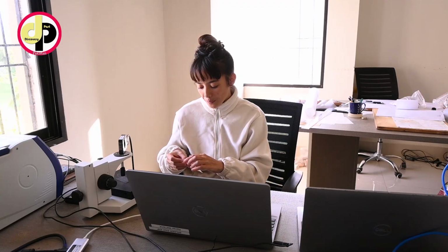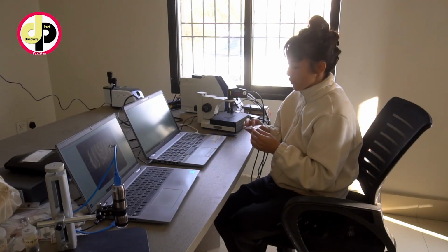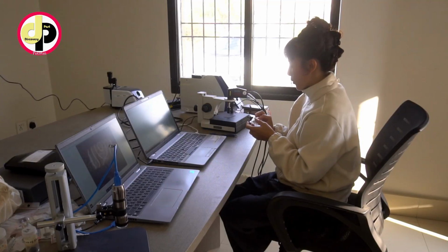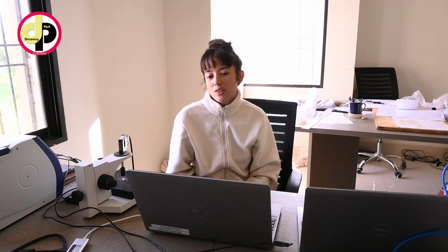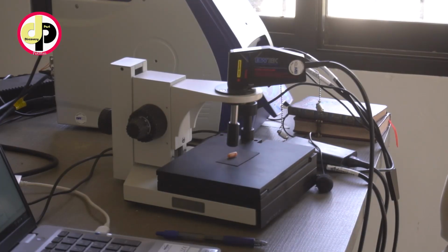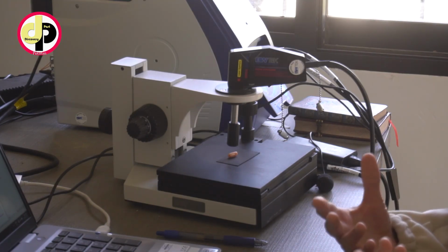So for example, I take one bead and I will put it under the Raman spectroscopy. It's one of the portable instruments that I brought from Sorbonne University, Abu Dhabi, to directly analyze it with a laser. And thanks to that, we'll know the composition of this bead.